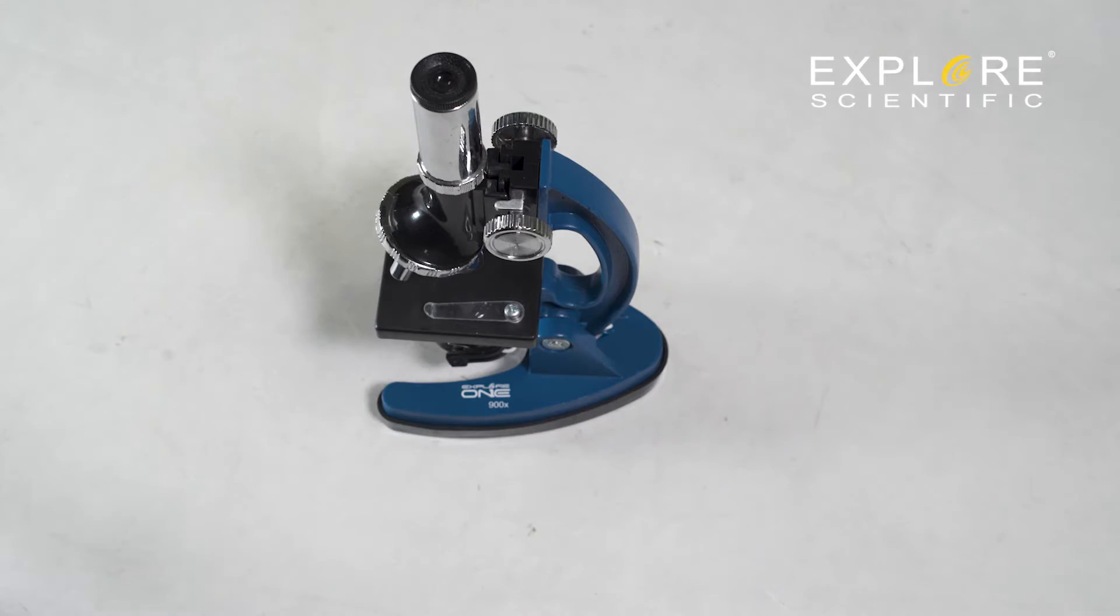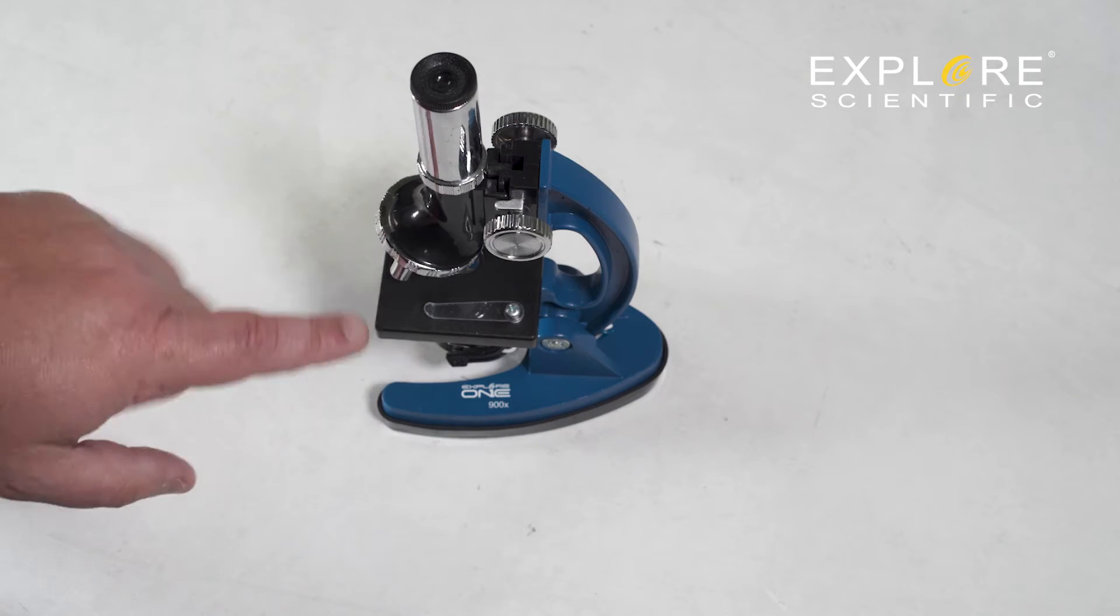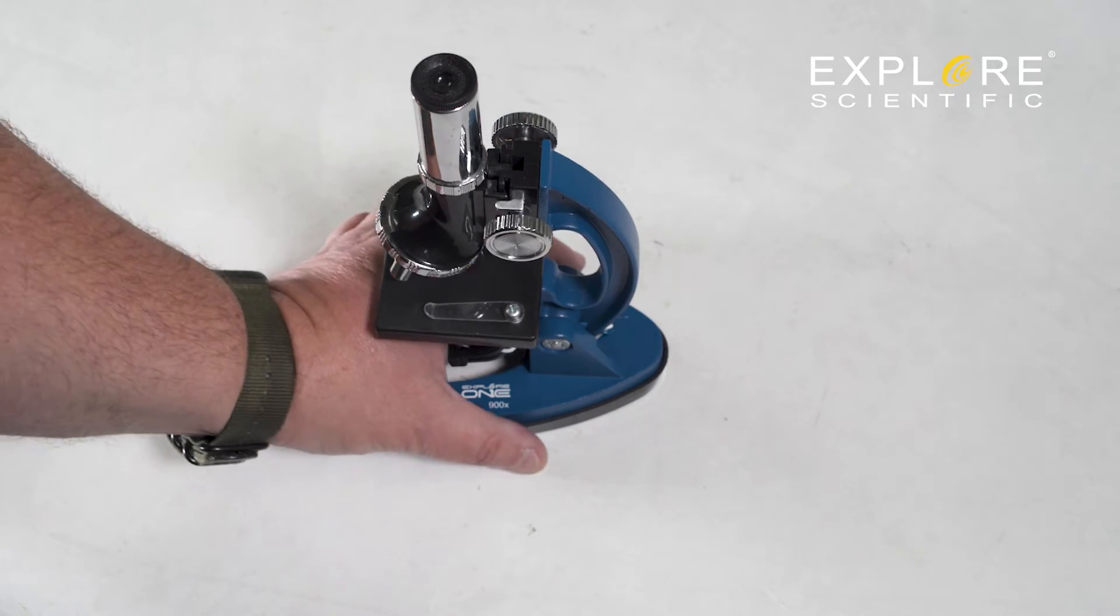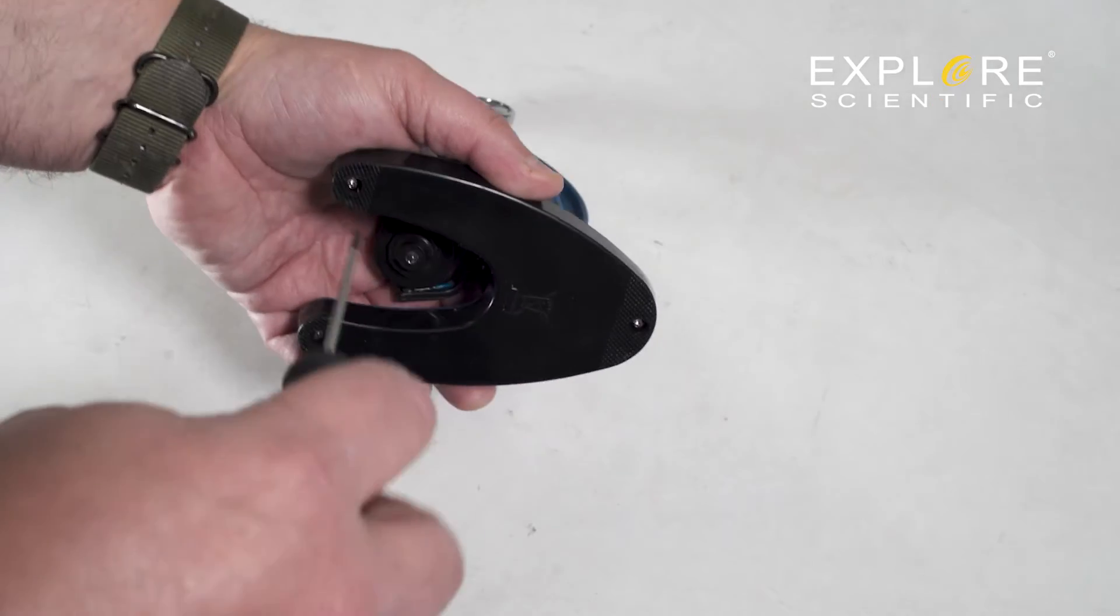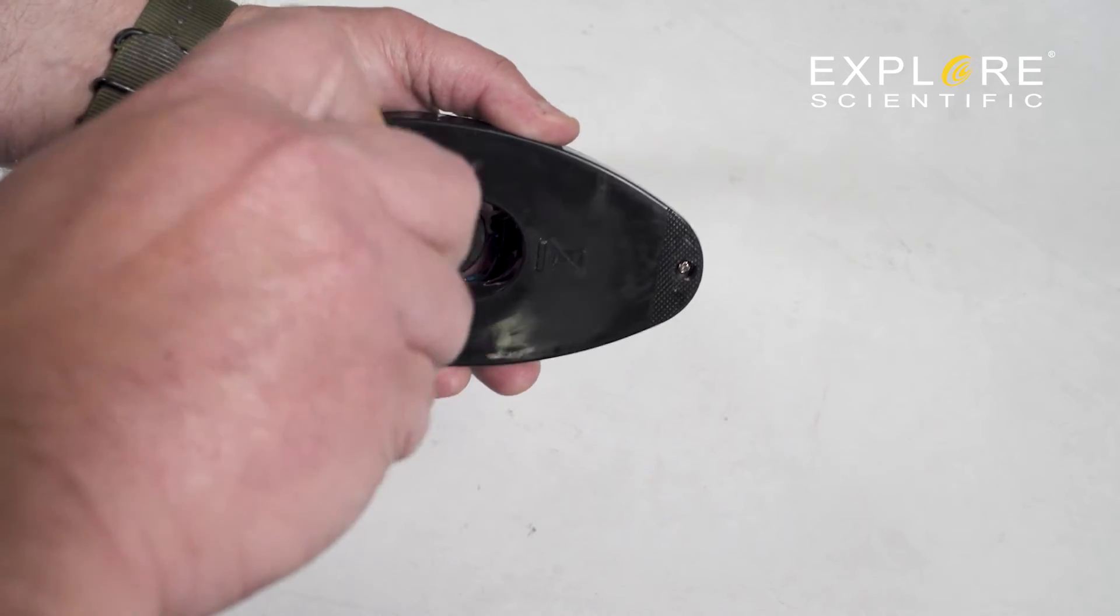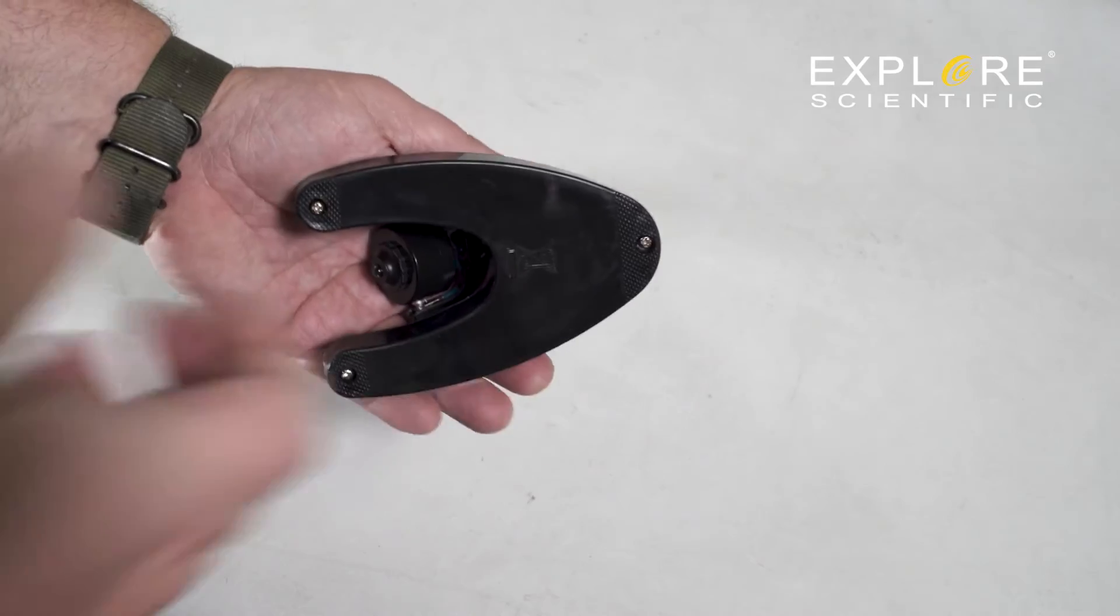To locate the batteries, remove any slides you may have inserted into the microscope and any accessories you have attached. Then turn the microscope upside down. Here you will see three small Phillips head screws. Use an appropriate screwdriver to remove the screws and then the rubber base.